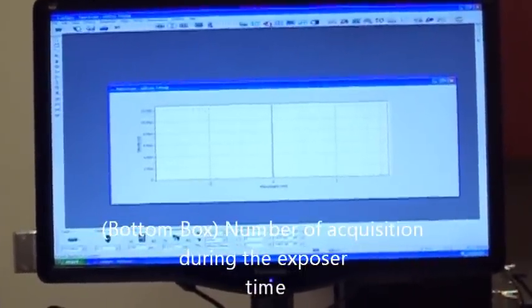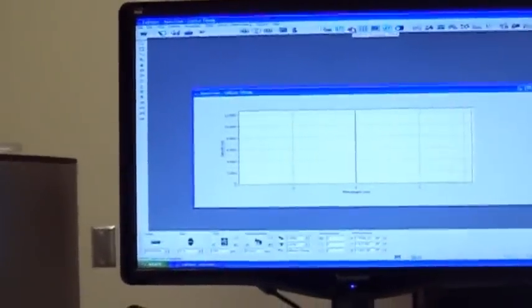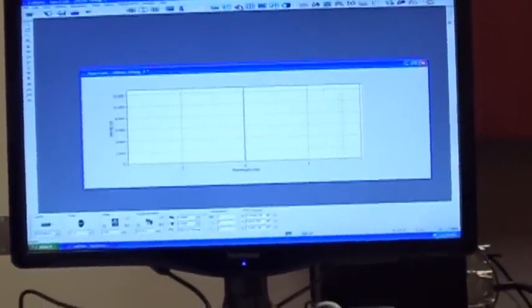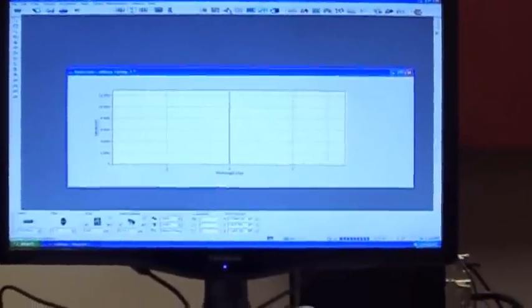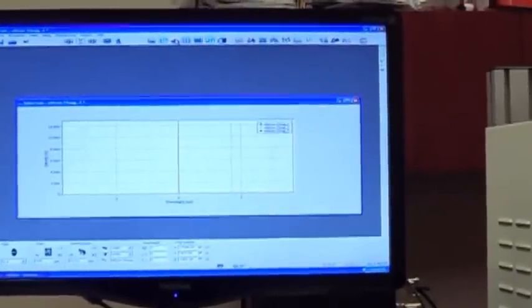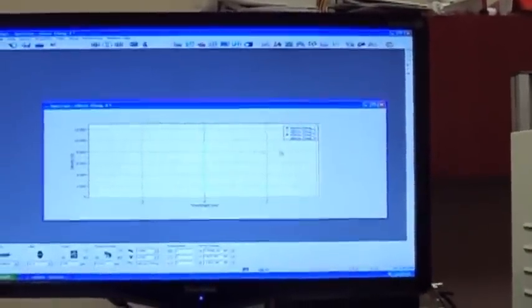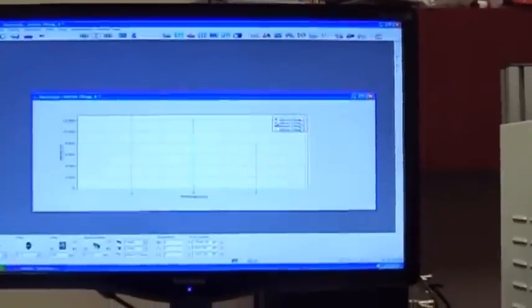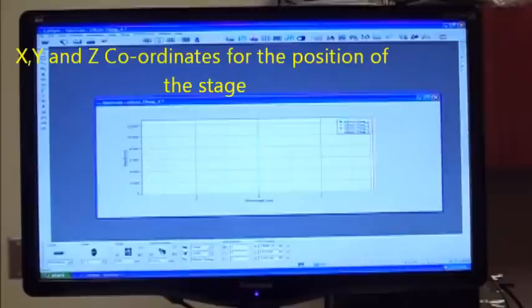So right now if I click on the piggy, it will take a 1 second, one-time accumulation, and then automatically stops by itself. And then every other time I click on the piggy, it will not delete the data. It'll keep saving more and more data files on top of each other. As you can see, the 4 data files here now in the corner of the Spectrum window, whereas the RTD will delete the old data and just write new data.